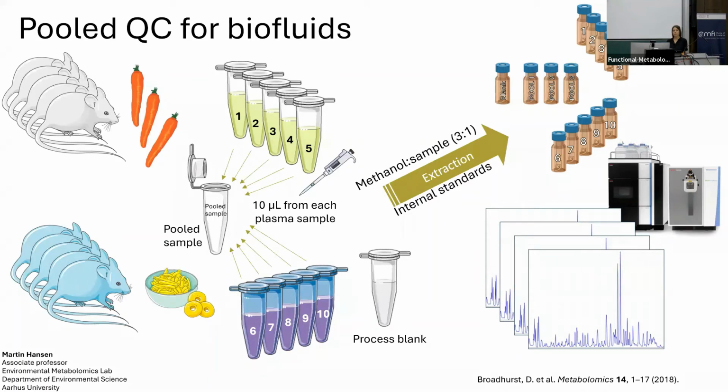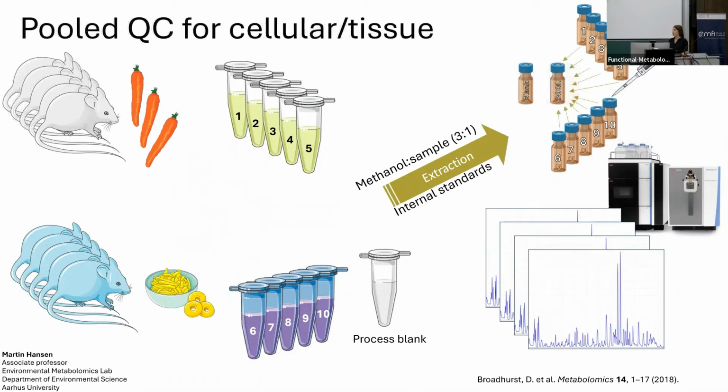That's interesting. Maybe one additional, can I just add one thing? An additional very important aspect there is practicality. Depending on what scale you work, you may not want to have multiple technical replicates, because that would increase insanely. The technical measurements are the repeated measurements on the platform, whatever platform it is. If you want the sample prep included in that, then go with this approach. And maybe that was the other approach with tissue. Sometimes it's not always possible to have the pooled sample before sample prep. Then you will go with this approach.